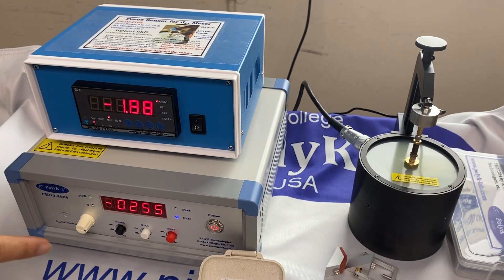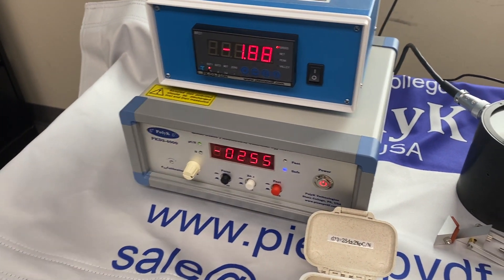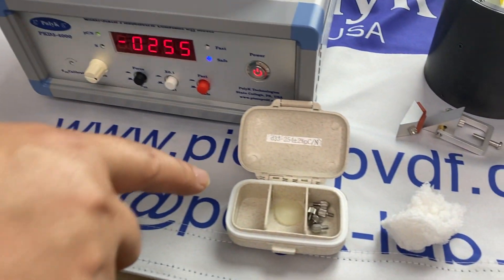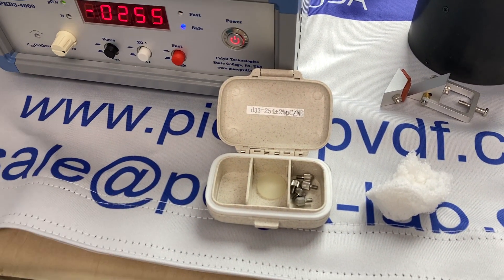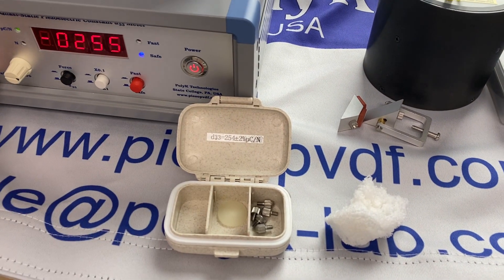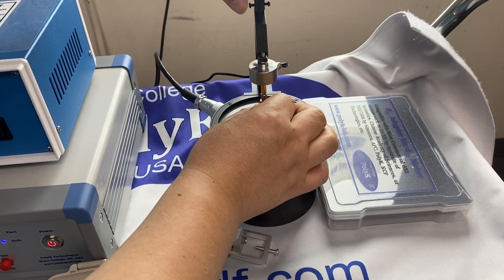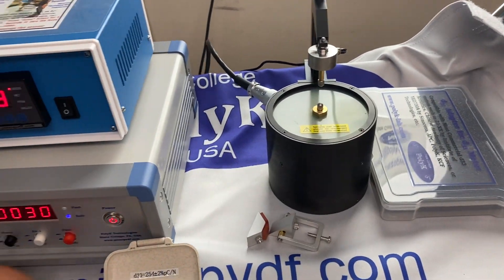You can see the negative reading — they are pretty close. The theoretical value is 254 ±2%. If you want to make it exactly 254, use a small screwdriver to adjust. For us, this is good enough. So the calibration is done — partial calibration. Now let's measure piezo ceramic and single crystal.